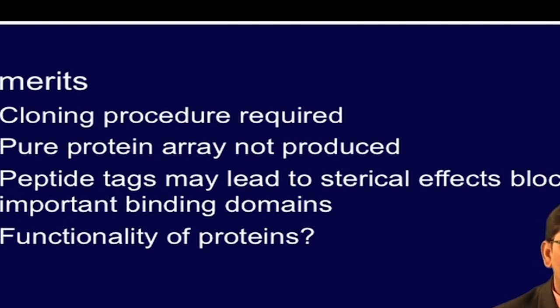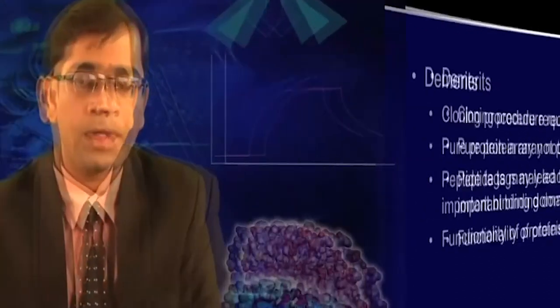The peptide tags, which are added for the capturing procedure, may lead to steric hindrance blocking, which could be important for binding domains. The functionality of the proteins still remains a question for any of the cell-free expression based methods. So, NAPPA method provides various applications similar to other test protein arrays, including detection of interaction with proteins and other biomolecules. Let us now discuss the working principle of NAPPA in this animation.